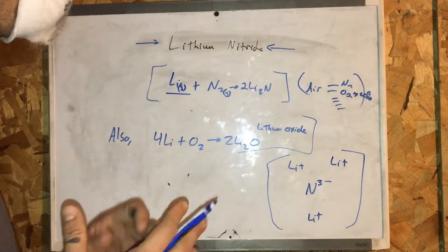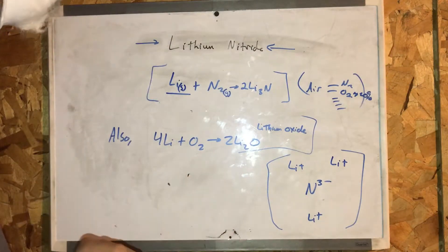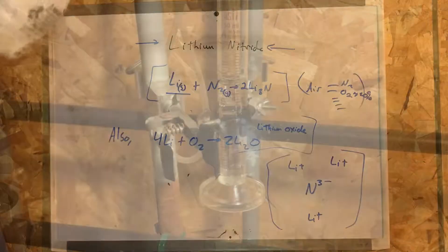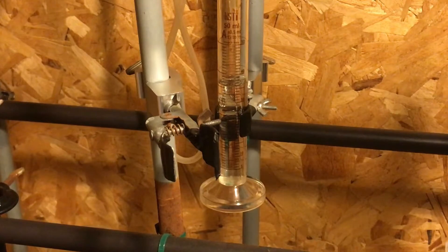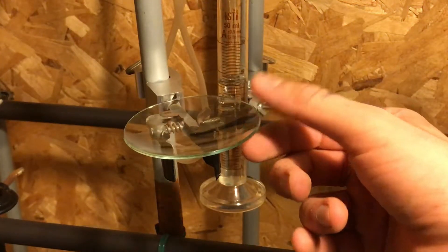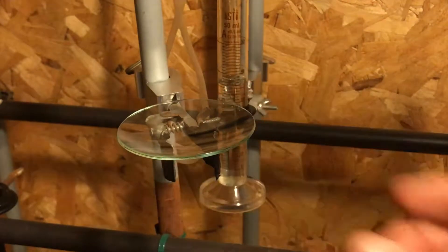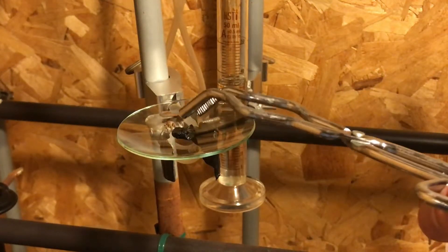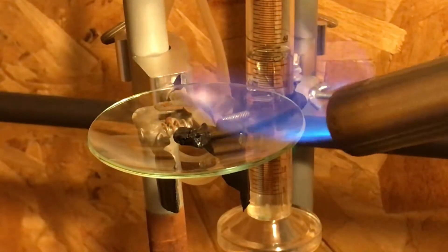So in this process, we know what we're doing. Let's head to the laboratory and create lithium nitride. Okay, so we're going to make lithium nitride. I'm going to place an evaporation disc here, a piece of elemental lithium on the dish. Okay, so I'm now going to heat the lithium metal.